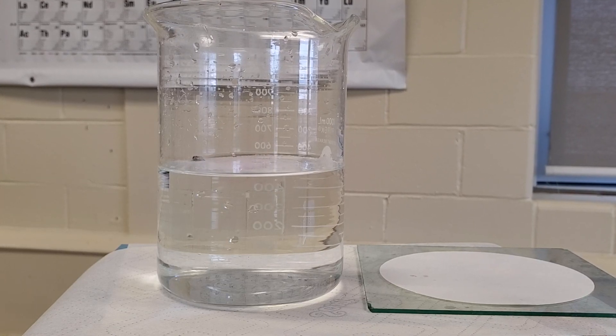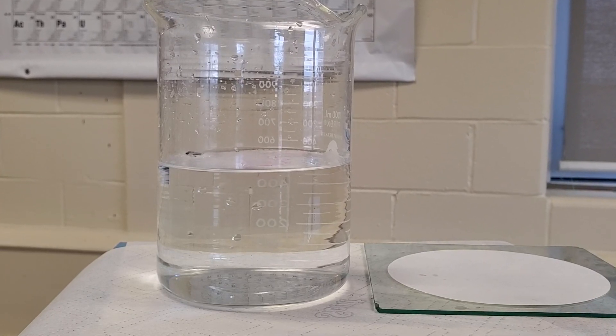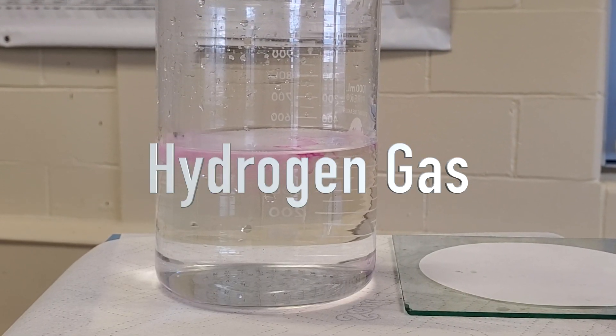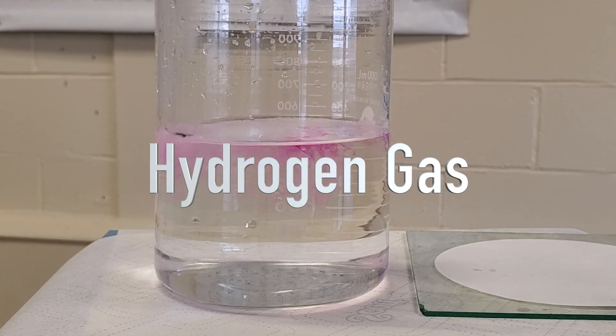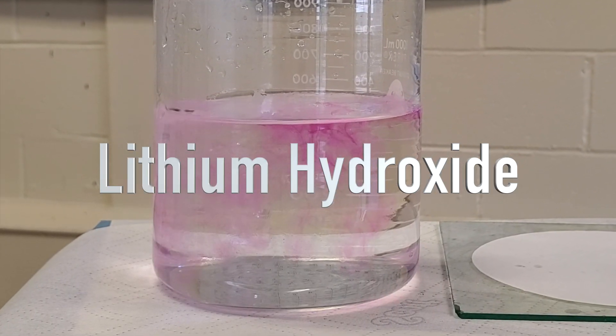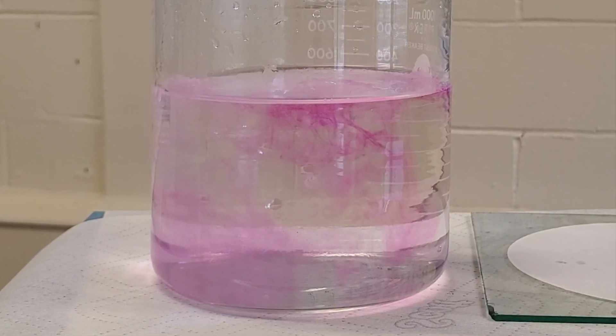You can see the lithium sample skimming around the water surface. Pretty reactive for a metal. The gas you see being formed is hydrogen gas. The water is turning pink because the solution forming is lithium hydroxide which is basic and hence why they call it the alkali metals.